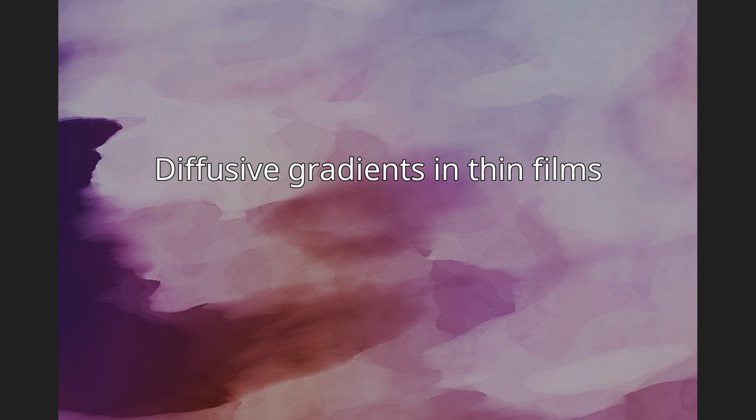Diffusive gradients in thin films. The diffusive gradients in thin films (DGT) technique is an environmental chemistry technique for the detection of elements and compounds in aqueous environments, including natural waters, sediments, and soils. It is well suited to in situ detection of bioavailable toxic trace metal contaminants.